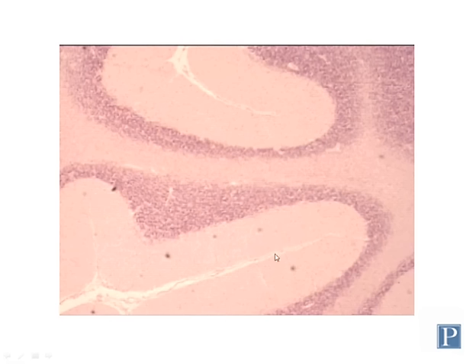This is the surface. Here you can see where the surface is folded. Here's surface over here. It appears on both sides, again, because it's folded. This is white matter, which is the deepest layer. So on either side, due to the folding of the cerebellar cortex, you have the gray matter. And the 3 layers are, here's one right here. Here's the middle layer, which is smaller, and here's the deeper layer. Let's take an even closer magnification view so that I can properly describe those layers.